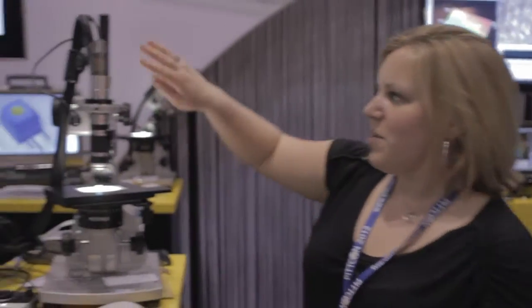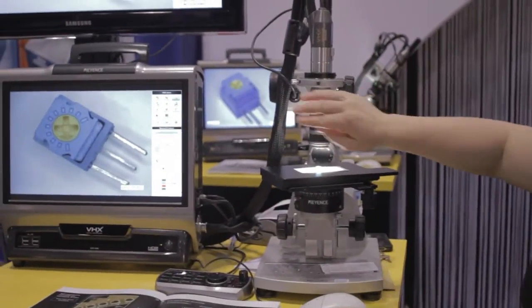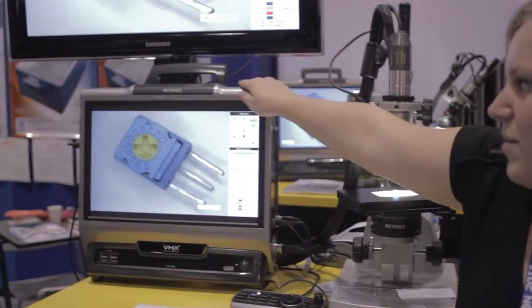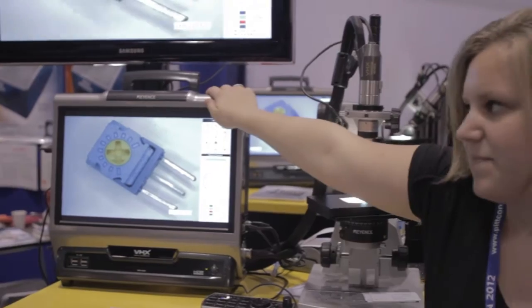As compared to your traditional optical system, there are going to be no eyepieces involved. There's going to be a camera here. It hooks up directly to your lens. Basically, it's going to communicate an image over here to the brains of the system.